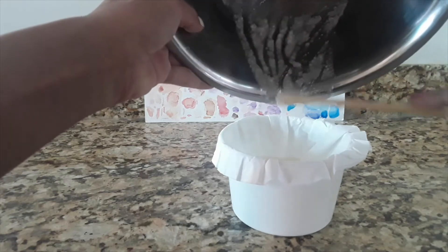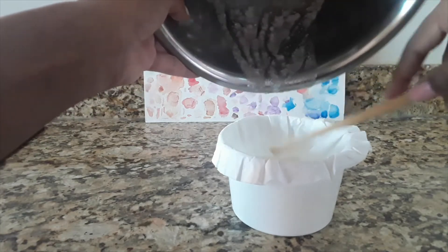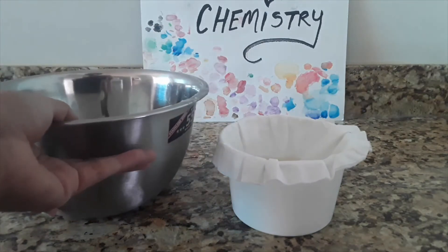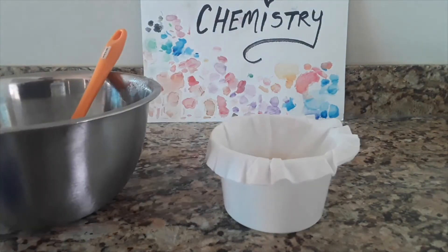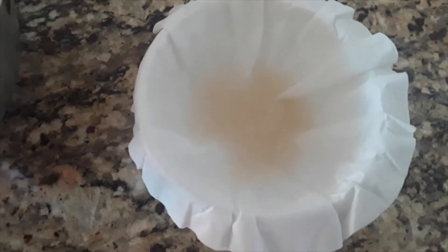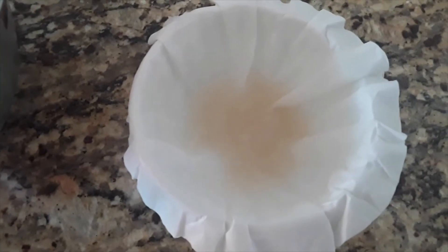Once it works, just use it. I leave this to gravity-filtrate overnight — I wish I had a vacuum system to go faster. Anyway, very professional transition — and this stuff looks discolored, but that's okay. We will deal with it soon.